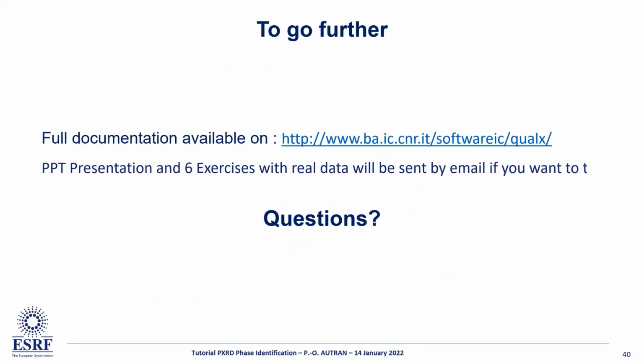So that's the end of the presentation. I will send you the presentation. And I also have 6 exercises with real data that I measured myself, or that my colleague measured, on lab machines, or, for example, ID22 data. Each exercise has information about what the sample appearance is, there is a diffraction pattern, and there is also the solution of it in the format of the software.